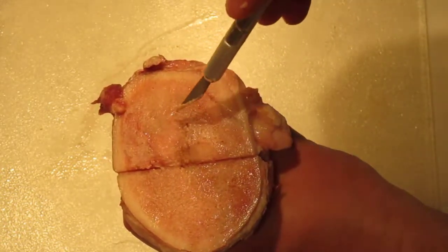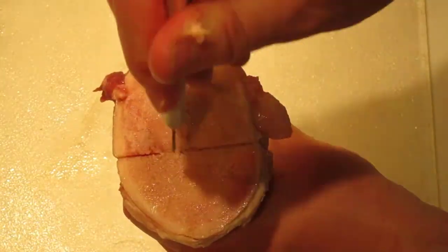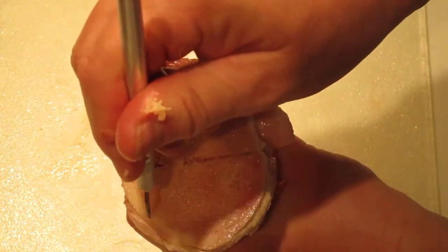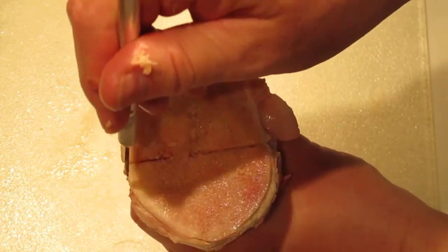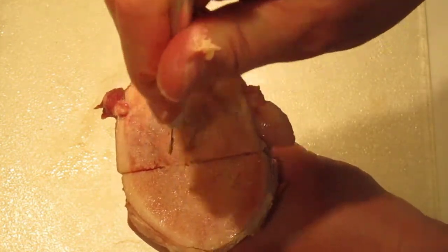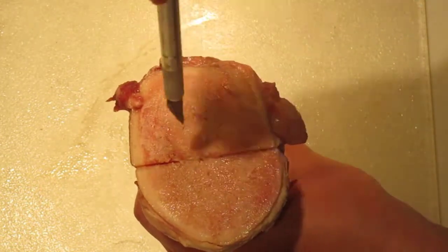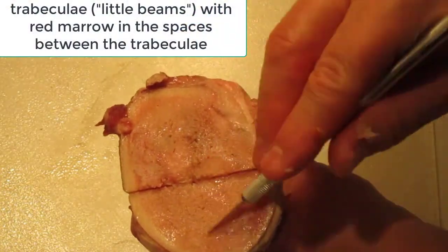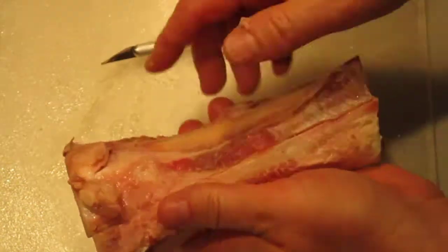You have spongy bone — also called trabecular bone or cancellous bone — here in the middle. If you poke in, I can actually poke into it, but on the cortical bone it just taps and I can't poke into it — it's too hard. The cortical bone is very hard; in the spongy bone the knife sticks. These are the trabeculae, and there's red marrow in between those little trabeculae.